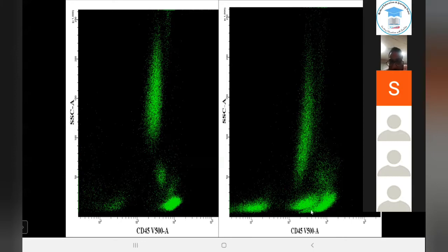No? Okay. So in this population, lymphocytes have increased. Do you see something on the extreme right? This is the lymphoid population, but there is some tiny gap here, and you see another cluster here. Do you see them as one, or as two? Two clusters, all right.